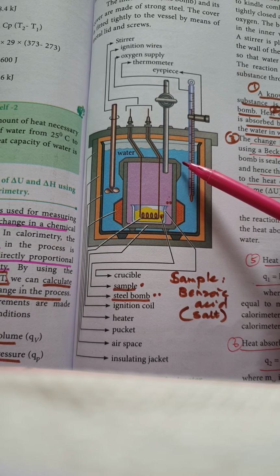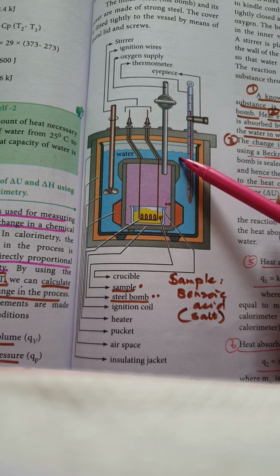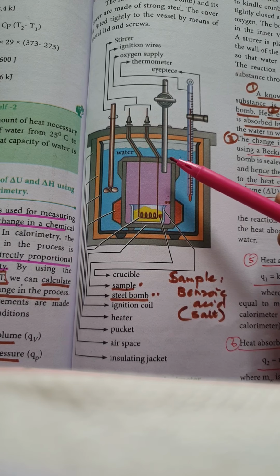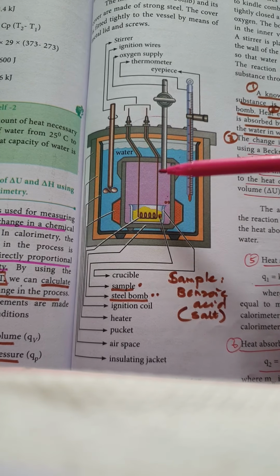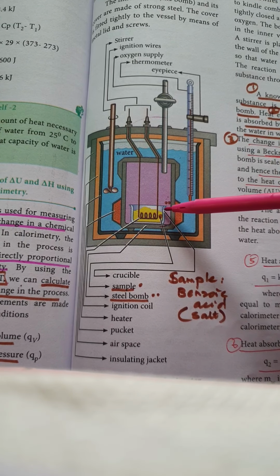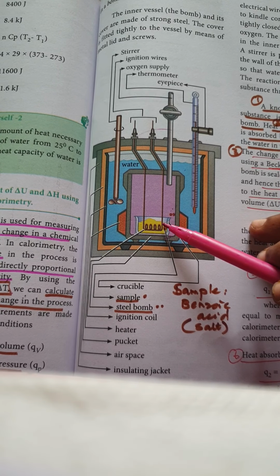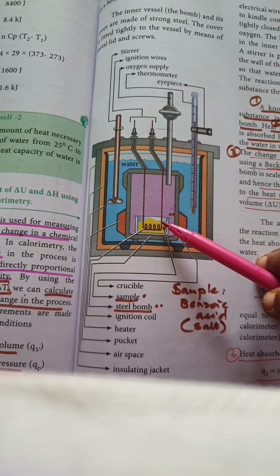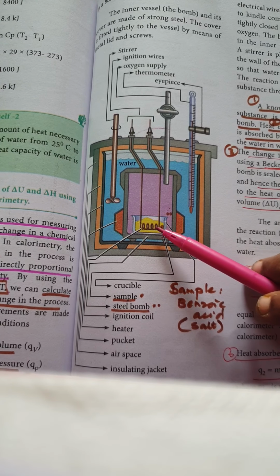This is the instrument which is used to measure the temperature change or the heat change. It is called a calorimeter, and it is also specifically referred to as a bomb calorimeter. Now, inside this apparatus, you have a sealed container in which a platinum vessel is kept, and a weighed quantity of the sample is taken. This yellow substance that you see is a weighed amount of the sample that is used for combustion. What is the meaning of combustion? Combustion means heating. So I'm going to heat it.